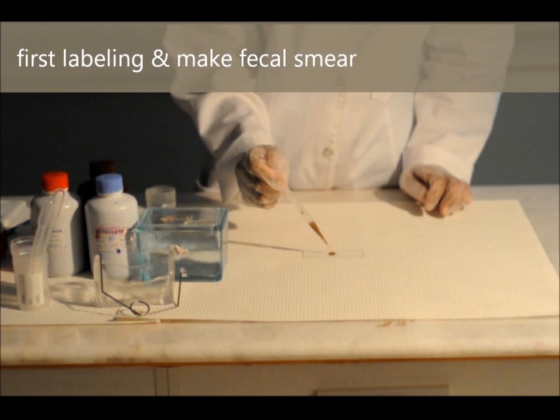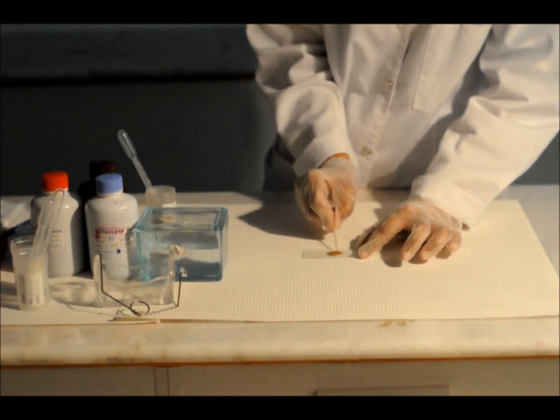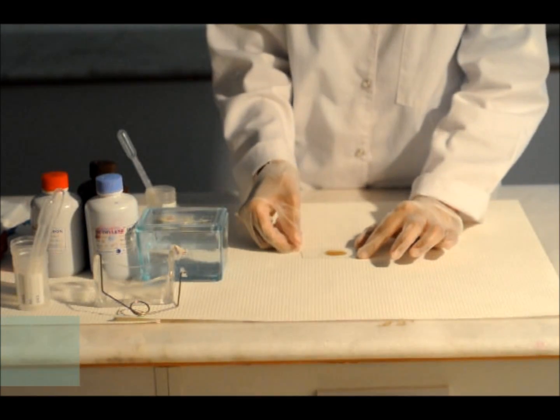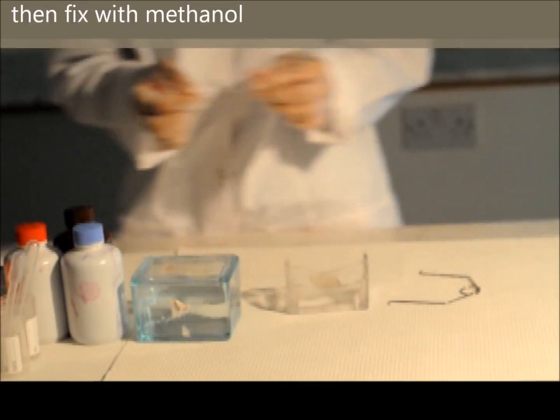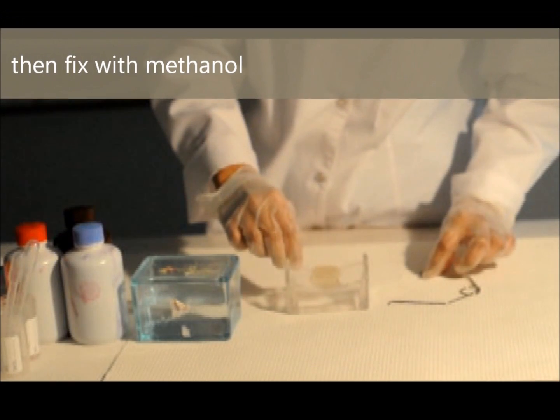The Modified Thin-Lunson staining is classically performed by preparing a thin smear of a fecal material. Let it dry, then fix it with methanol for 3 minutes.